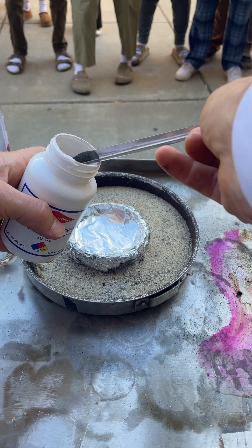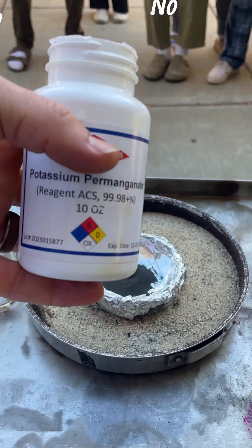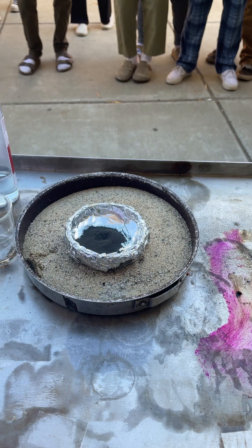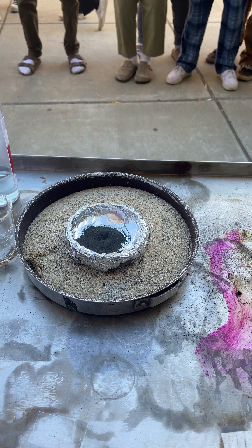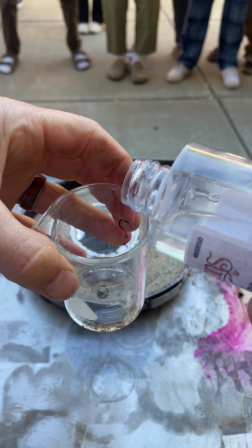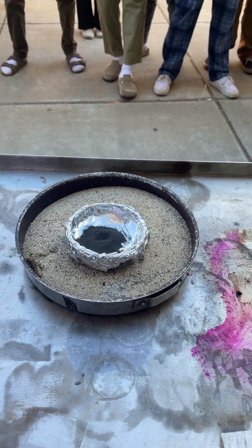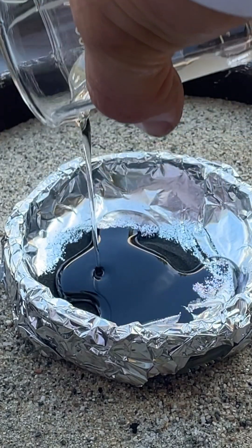Let's get our potassium permanganate and make a nice big pile. Has this been heated? No, it's not heated — just nice cold room temperature potassium permanganate. Our glycerin — is this heated? No. I'm going to put it in this little beaker right there. We'll put a nice little glob in. Ready? Cold and cold.